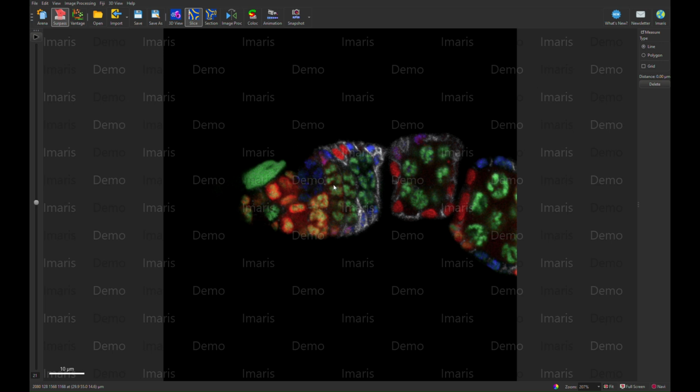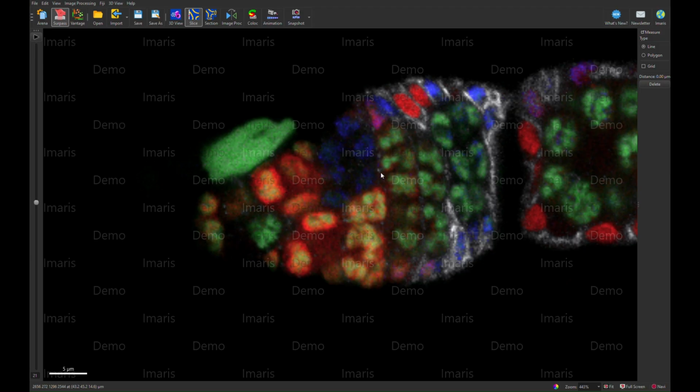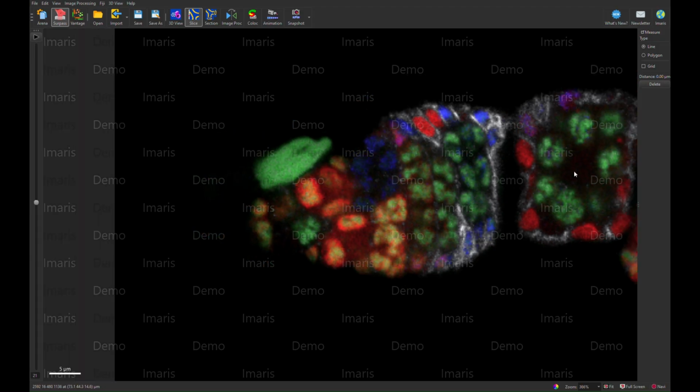Today we're going to be looking at a Drosophila germarium. Here on the right we have an egg chamber. This is a two-dimensional slice, and on the left you can see the cap cells here at the anterior. This green blob is just part remaining of a muscle sheath of some kind. You can also see different colors representing different cysts as they mature through a germarium.